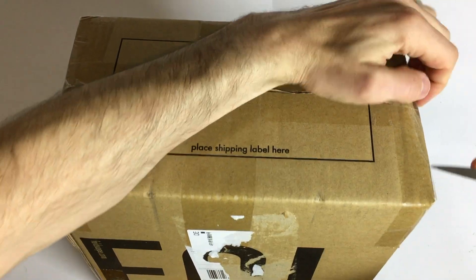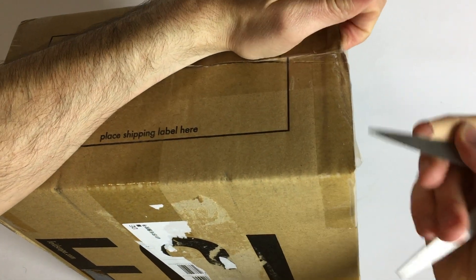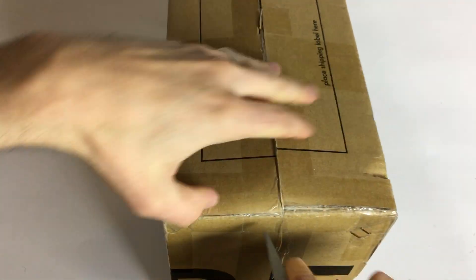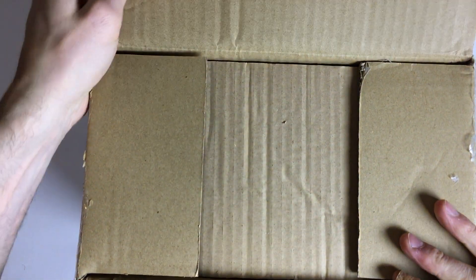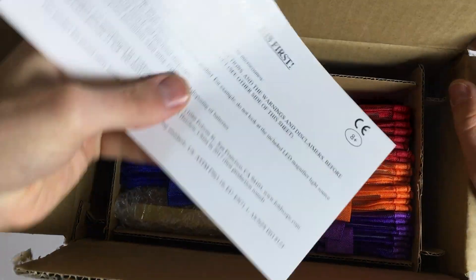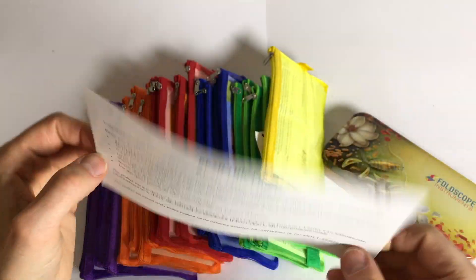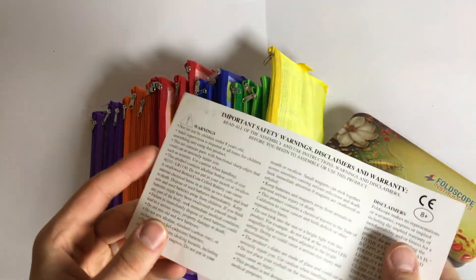So let's have a look. Open it up. As you can see I resisted the temptation of opening it myself before. Ta-da! Okay, let's have a look inside. More paper, and it's colorful. This is actually the first production round of 2017. I think before they just manufactured small quantities for showing off, field tests, proof of concept and stuff like this.